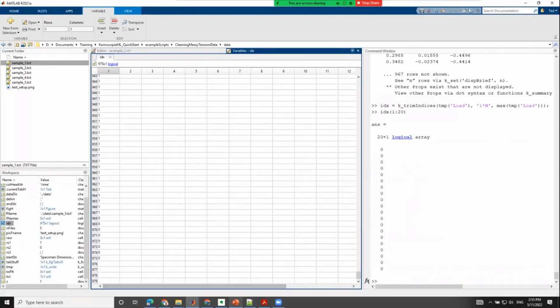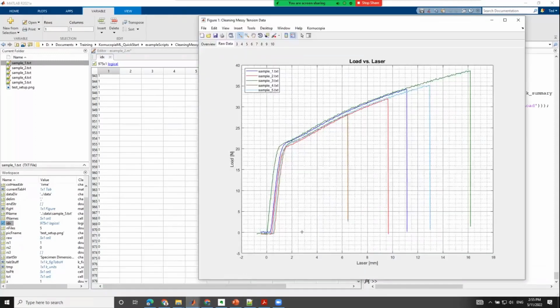And what that is really telling you is all these data points weren't part of what's being kept, because I put a cut here, and then for each curve, I put a cut at its max. And so then it'd be a bunch of ones, which means keep all this data. And then the last few data points are zeros, which means don't keep those.